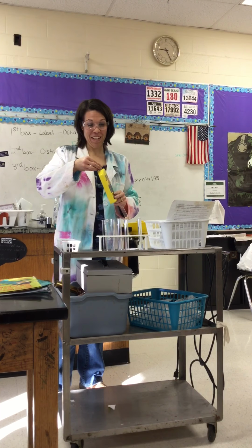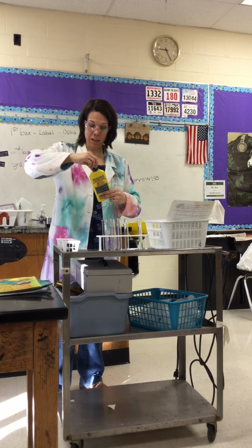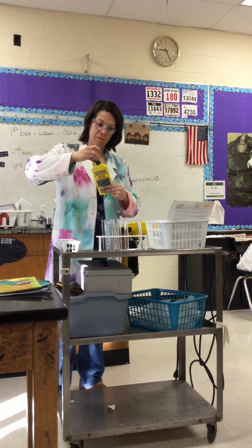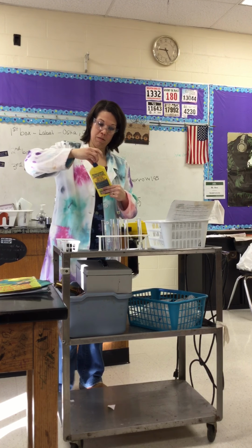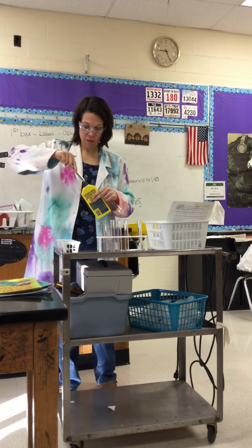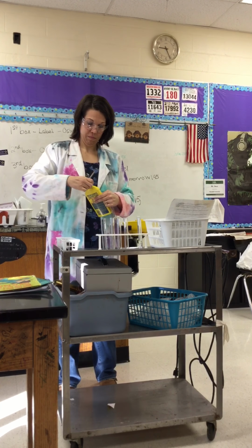Lighter fluid is nonpolar. So now if I can get it open, somebody shoved this so far down. Well, it's like the school employee. Like that's a Bunsen burner. I was just kidding.